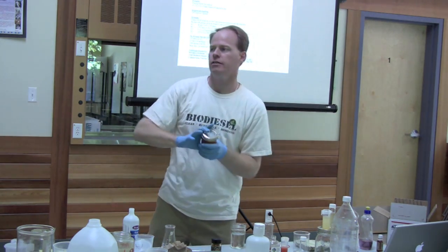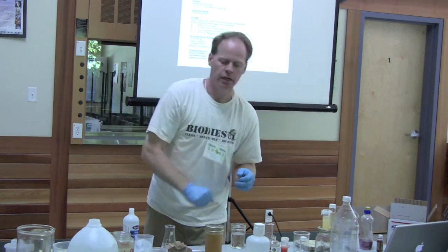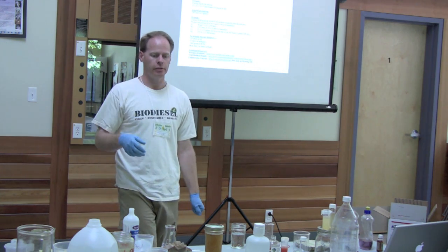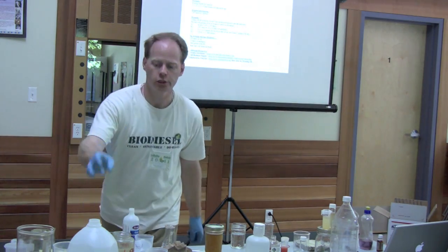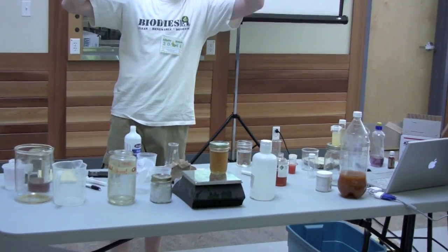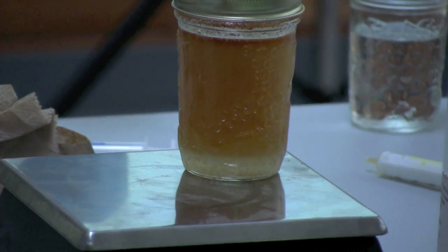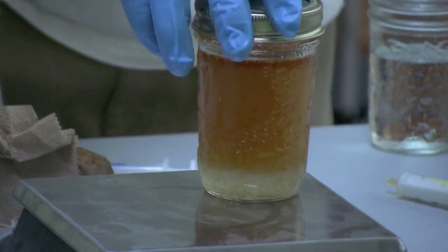And the shake 'em up test is nothing more than I just shake it a little bit and I let it settle. Normally I give it an hour and I would have shaken it a little bit harder, but we've got like 5 minutes. All the water that settles to the bottom should be as crystal clear as it was when you put it in. If it's cloudy, that means that the water is pulling soap out of the fuel, and you still got soap to wash out of your fuel. Soap's one of the biggest things that likes to plug fuel filters. So that's the soap test.